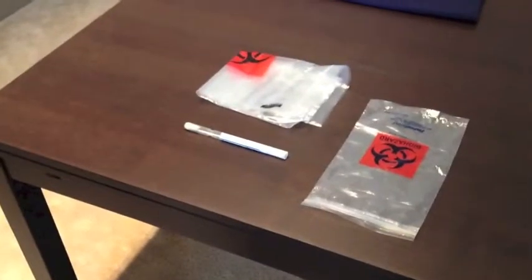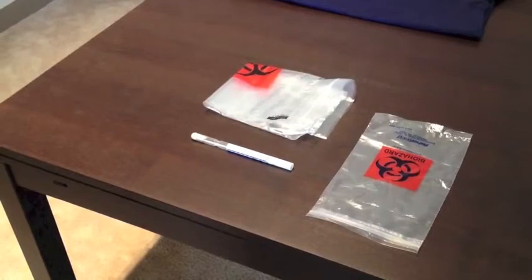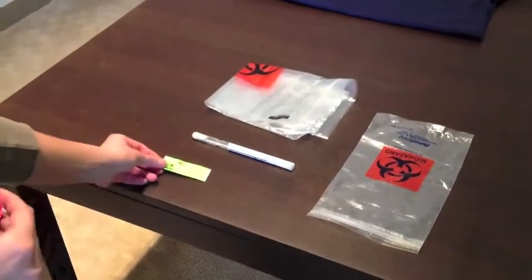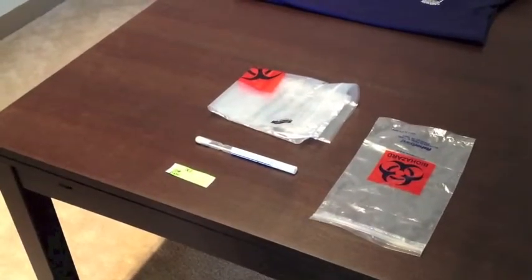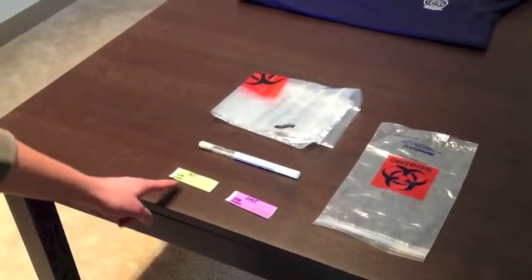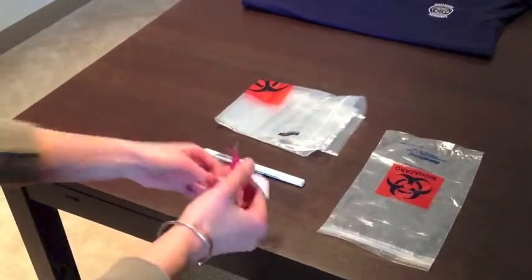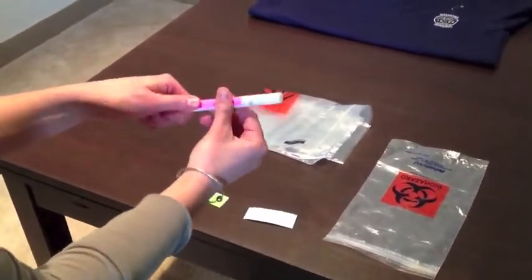Once you have collected your sample, you must label it using the stickers provided. If you have just collected your pre-laundering sample, use the green sticker. If you have just collected your post-laundering sample, use the pink sticker. Write the date onto the sticker.